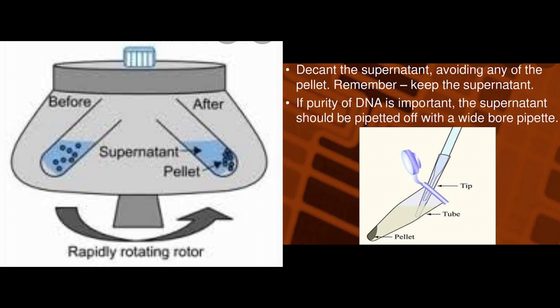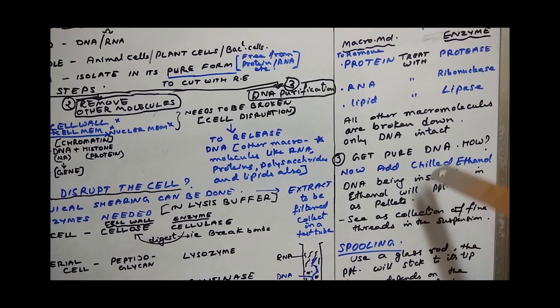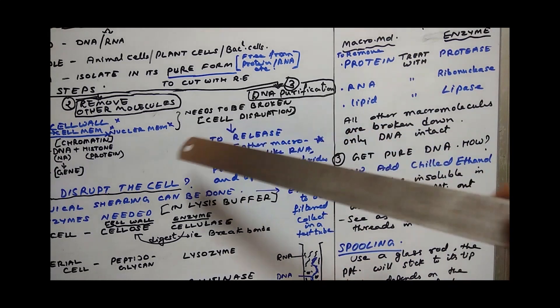So that the digested macromolecules settle down as pellets, and the supernatant - that is the clear liquid up - contains the DNA strands. We will pour it into another test tube, that supernatant part, and do the further steps with it. That was the second step - removing the other molecules.